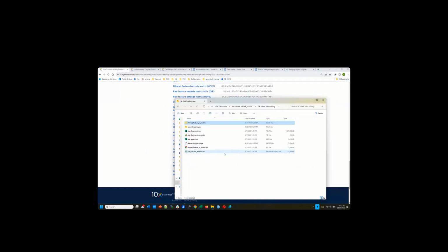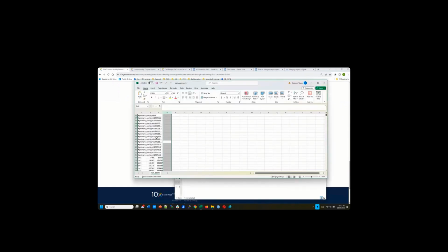What we need is another file called the peaks.bed file. This file format is very much the same as the other one, but this is lined up for all the cells, and you only have a chromosome, start and stop location. So all cells will have the same information, the same location. Think about it, for every gene, they line up for every sample, for every cell, right?